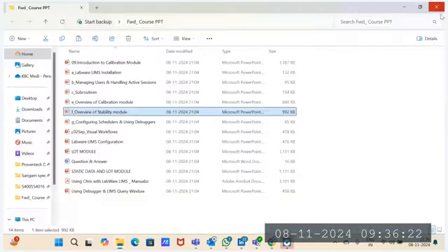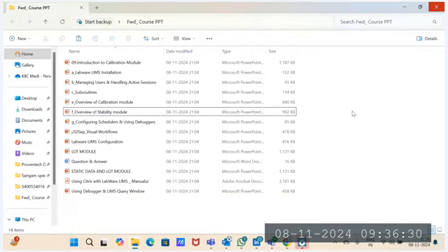And apart from this, yes, there are some more topics. Even if I explain one by one on the screen, you may not get the complete picture. So when we sit in front of the application, I will start one by one, like first master data, followed by installations, user management module, calibration module, and workflow, work allocation related topics, and LIMS administration related topics, like LIMS debugging, report preparations, like dynamic data differences, table master and table template.